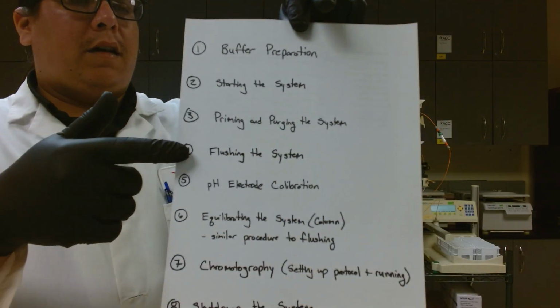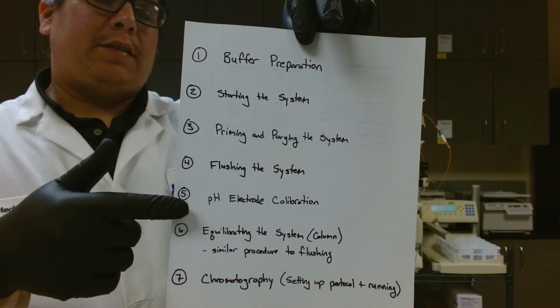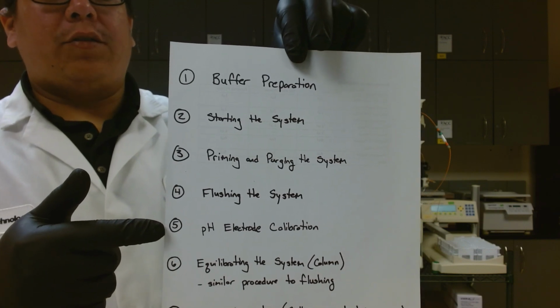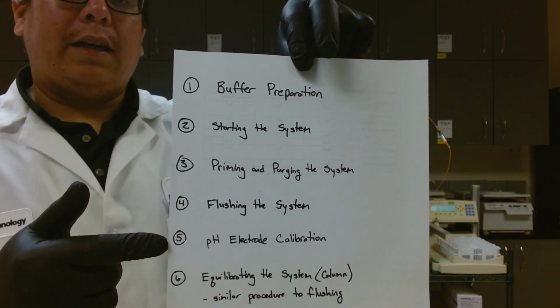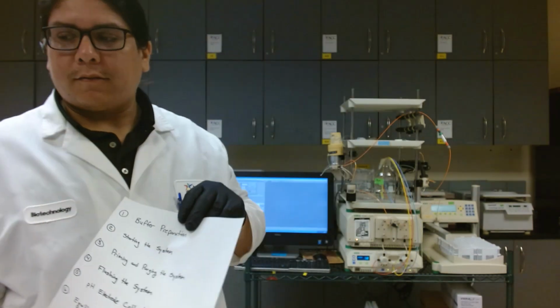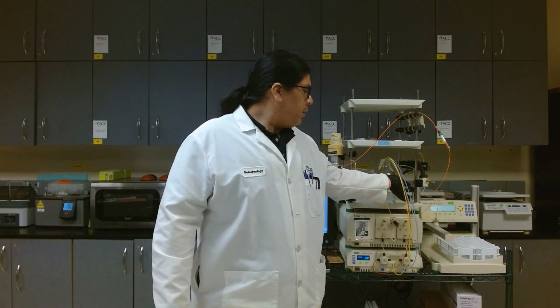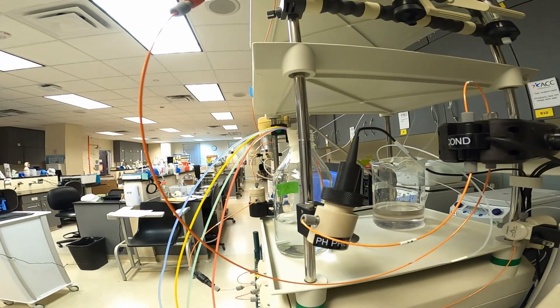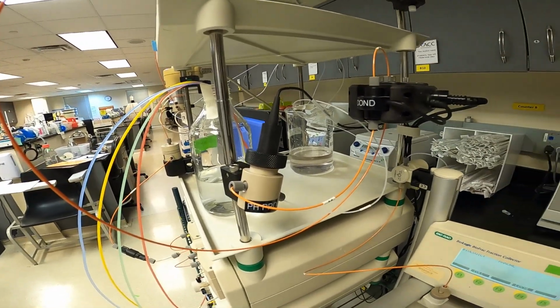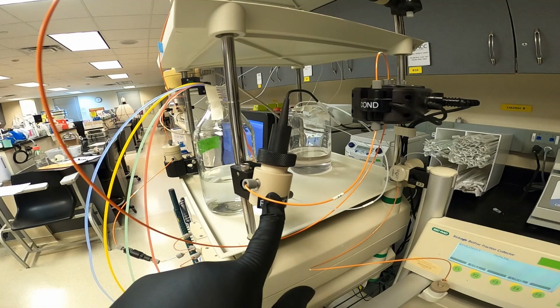Okay, so we've now flushed our system. And next thing I'm going to show you how to access the pH electrode itself, and then where to find the calibration wizard on the software. All right, so our pH meter is housed here in this probe. I'm going to show you here how to access the pH probe. See, it's here in this beige housing.